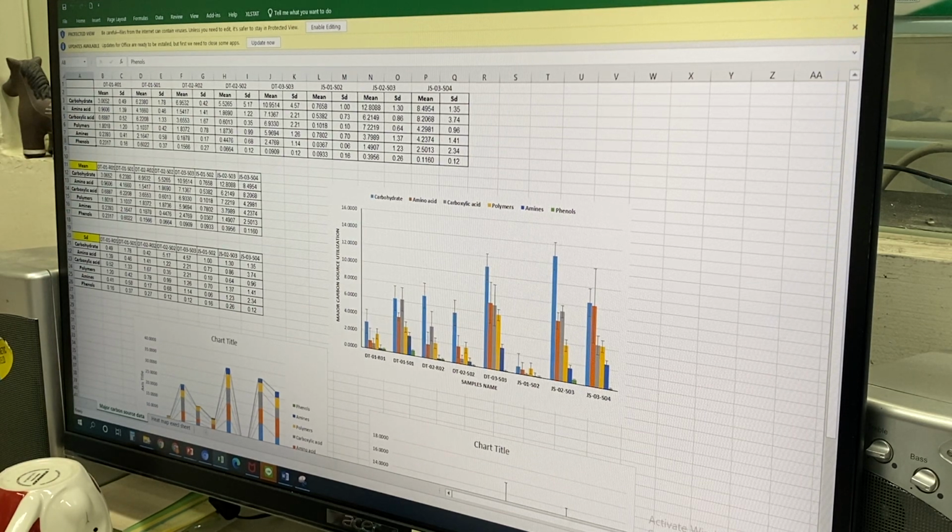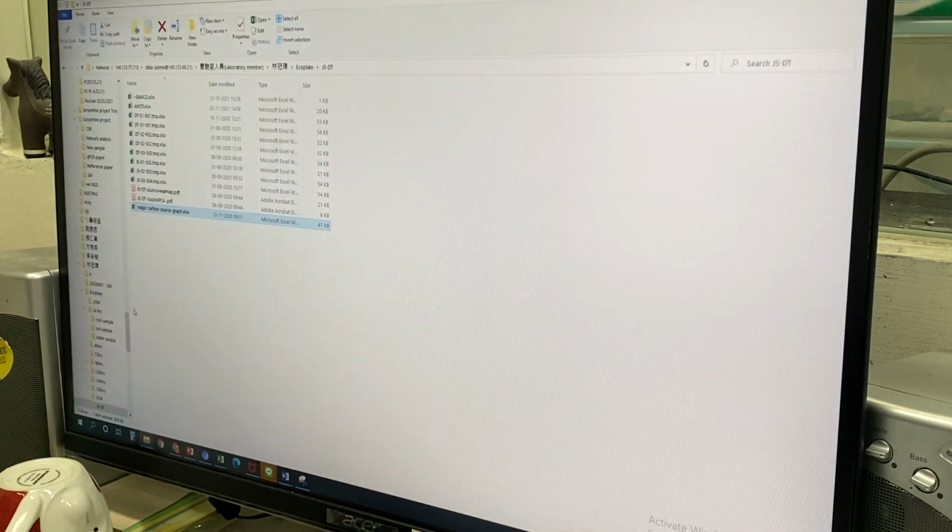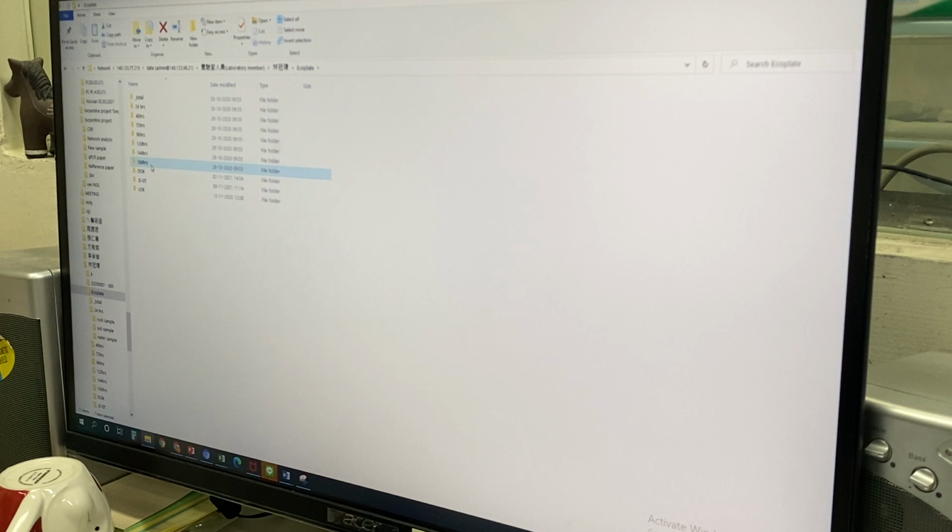So you have to go 48 hours. Only you have to do this one.